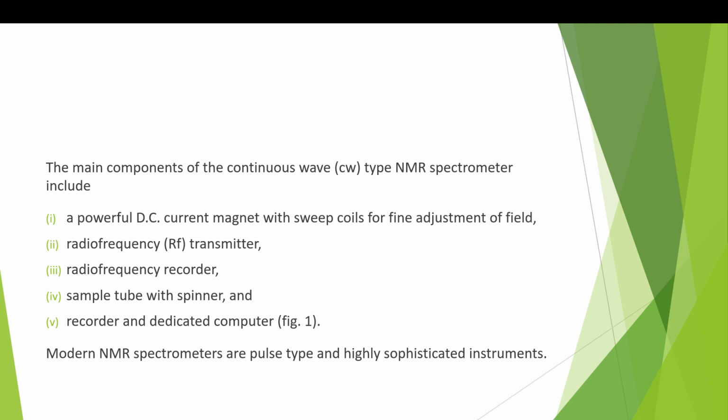However, the modern instruments are highly sophisticated pulse-type instruments, very costly.